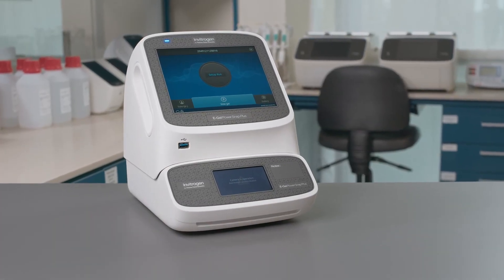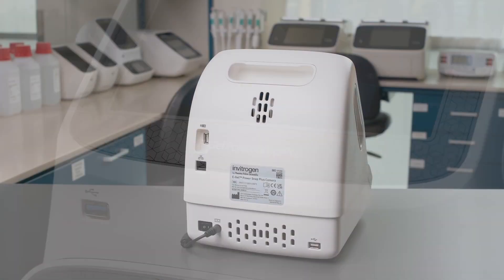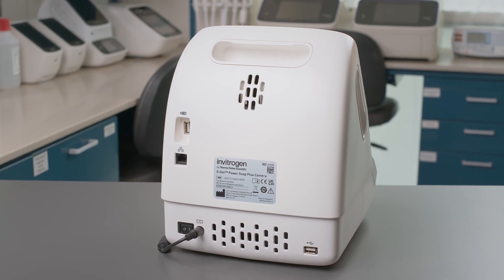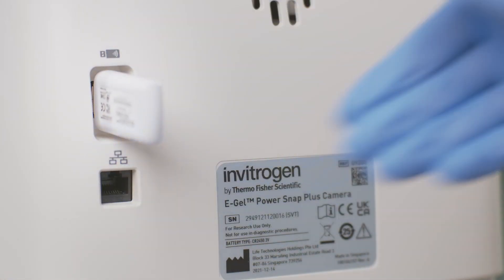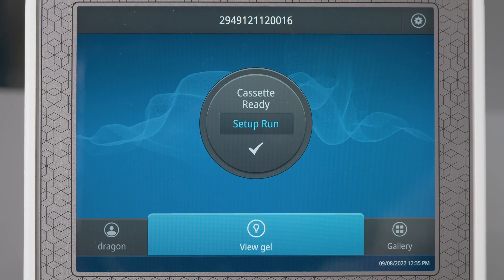The camera module of the Invitrogen eGel PowerSnap Plus Electrophoresis system can now be connected to a wireless network or internal server. For wireless connection, insert the included USB Wi-Fi dongle into the USB port located at the back of the camera module.